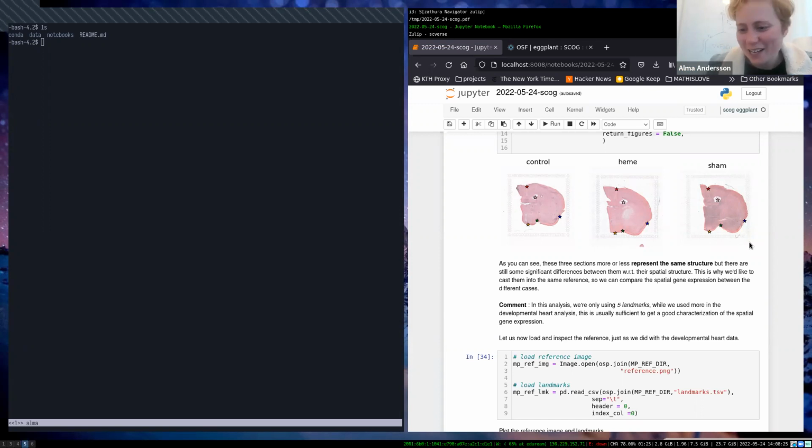Usually we're handed the data and the question is, try to solve this for us. I would say try to avoid ruptures or squeezing or unnecessary elongation. The more distortions that you introduce into your data, the harder it is to correct for. There's always something to correct for. If you can try to keep it as clean and neat as possible. But I guess that's what you always try to do. It's not someone who intentionally tries to fold their tissue sample.